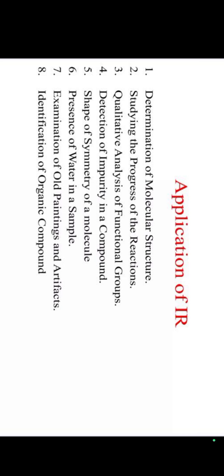To study the reaction progress of a certain compound in the IR spectrophotometer. Third one, qualitative analysis of functional groups, to determine and identify the functional group quality. The fourth application is detection of impurity in a compound. To detect the impurity of a certain compound is the best method for determination of impurities in organic molecules.